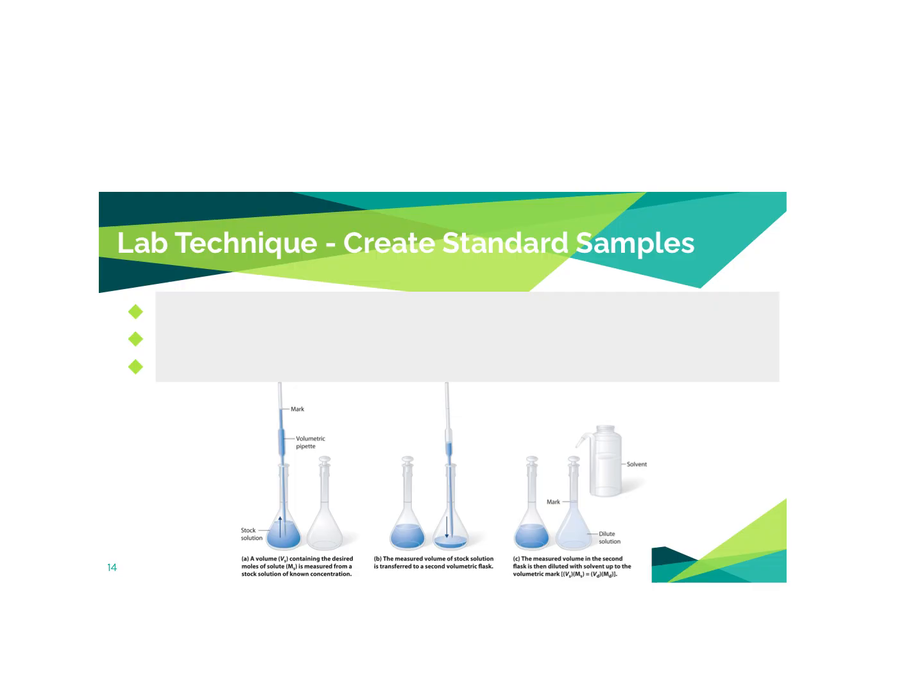Once you've created that stock solution, what you can do is create standard samples using what's known as serial dilution. Or in other words, dilution in a series.